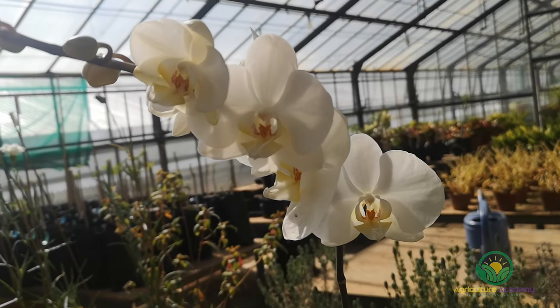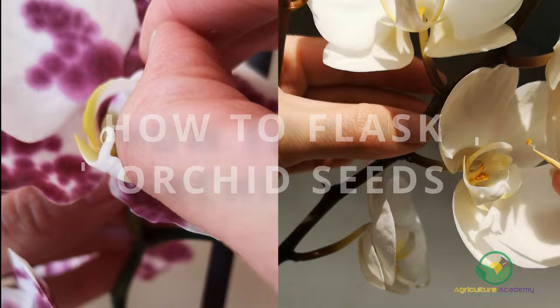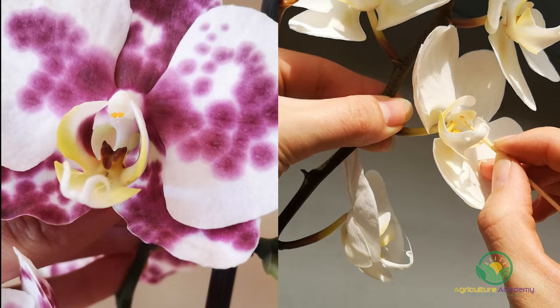In a video we created a while back, we showed you how easy it is to pollinate orchids. We have had great feedback on our tutorial, and we are so excited to release a follow-up to this video. Today we are going to show you how to flask your mature orchid seed. We will start with some background information on why orchid seeds need special medium to grow and why.